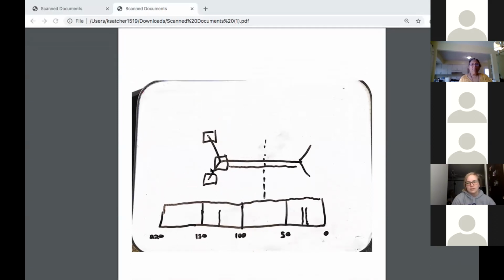Okay, so this is the first one. You can see that there are 3 unique carbons. You get 2 methyl groups and then an sp2 carbon. The sp2 carbon is going to be shown right here in the 150 to 100 range, and the 2 methyl groups are equivalent because both of them are equal to this. So it's going to be 2 equivalent CH3 methyl groups right here in the 0 to 50 ppm range.